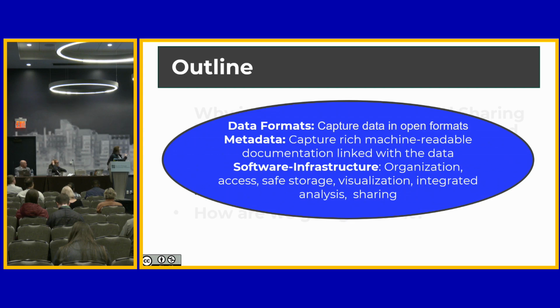And then software infrastructure, this is where, for example, PIDs come in. In order for us to use PIDs, first of all, somebody has to take the responsibility for creating them and managing them, and then we can use them. So there is a whole lot of stuff that has to happen that we are not necessarily directly responsible for, but that is really important.